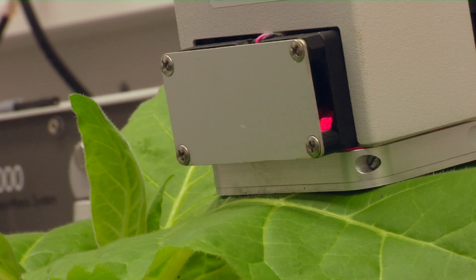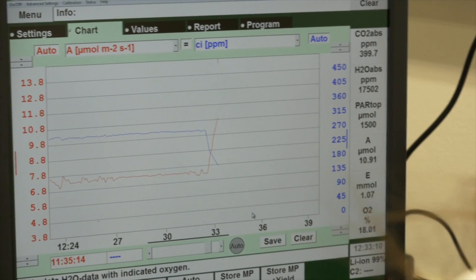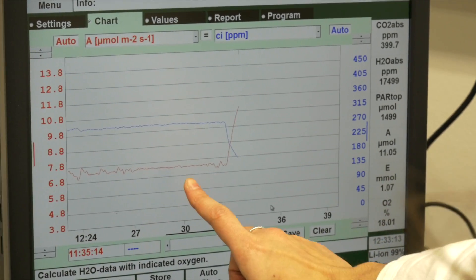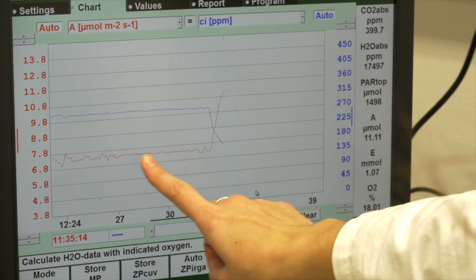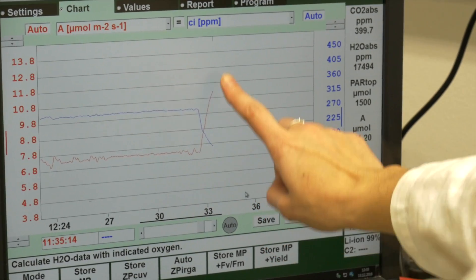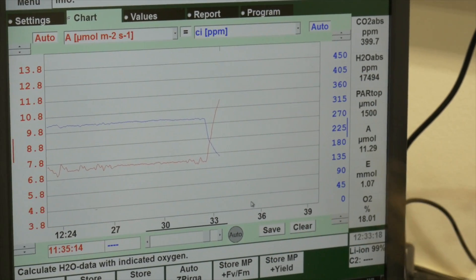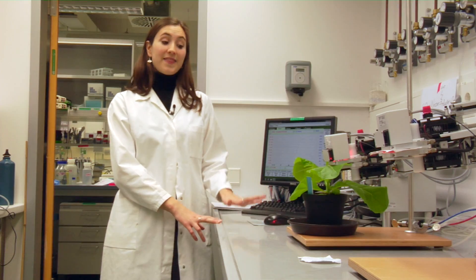Now I'm going to increase the light intensity. The plant is reacting to the increase of light — this is the CO2 uptake — and as you can see it's slowly increasing, which means that the photosynthetic rate has also increased. And that's what I did for my PhD thousands and thousands of times.